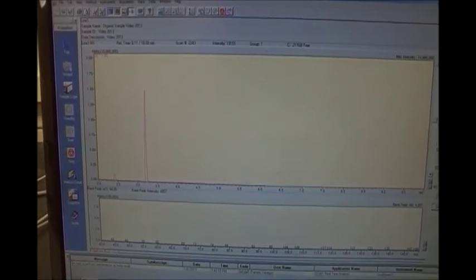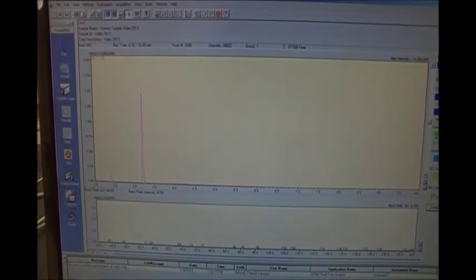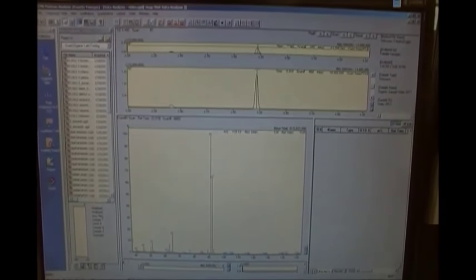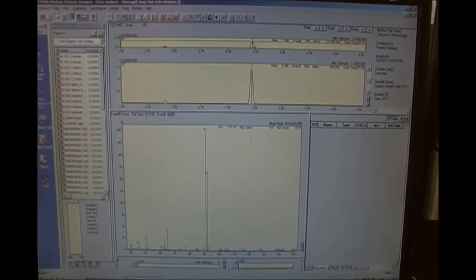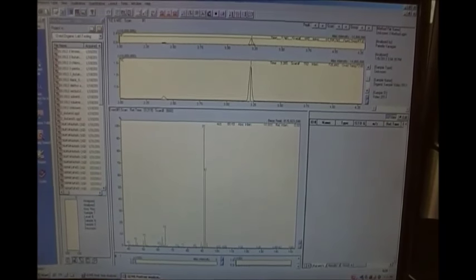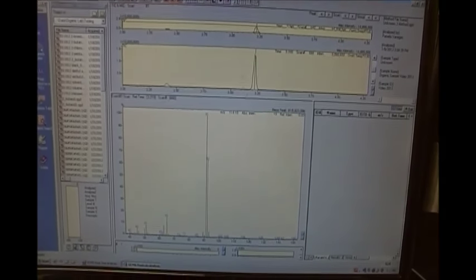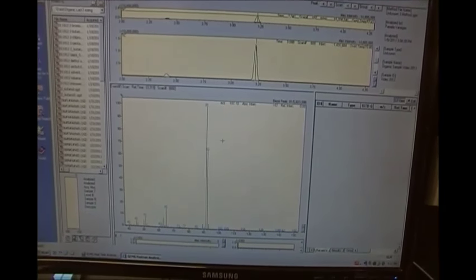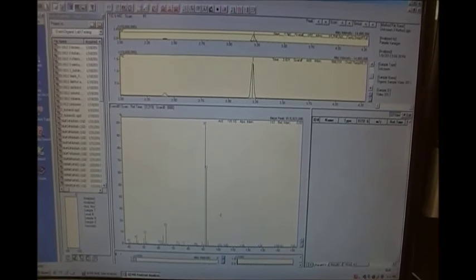As you can see, there's nothing else following that. So what we do is after we see this peak here, we need to analyze it. So to analyze it, we'll go through this screen here. This here is our peak. We click on the top of our peak right here and then we'll see the mass spec data for that peak. As you can see here, the mass spec says that whatever caused this peak here has a molecular weight of 92, 91 to 92.